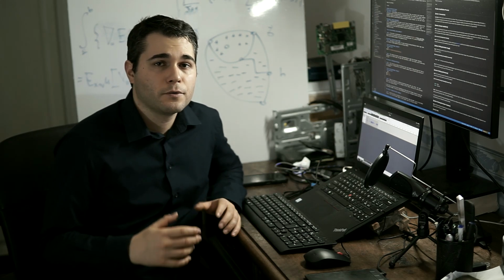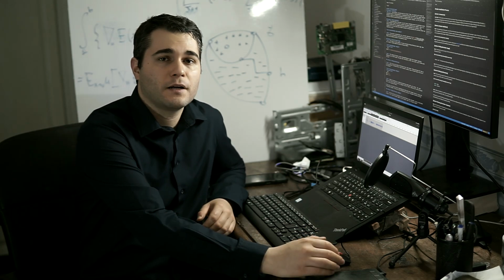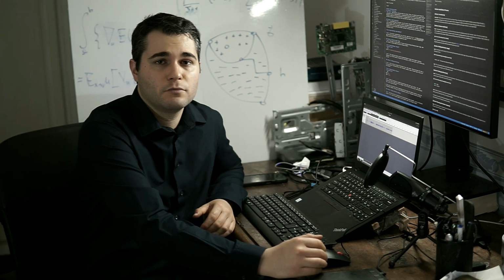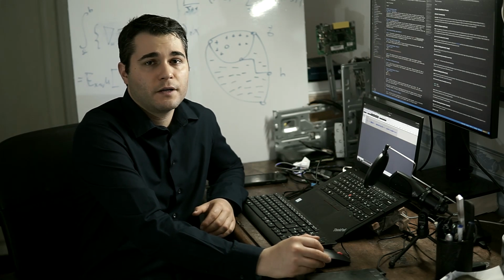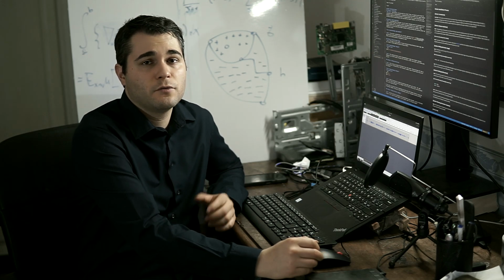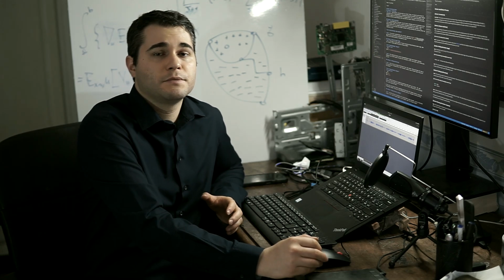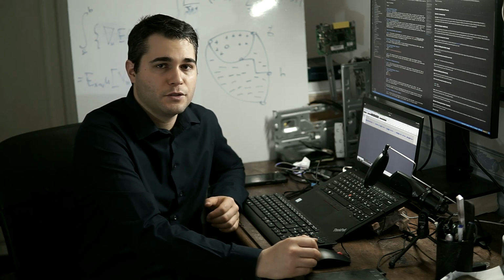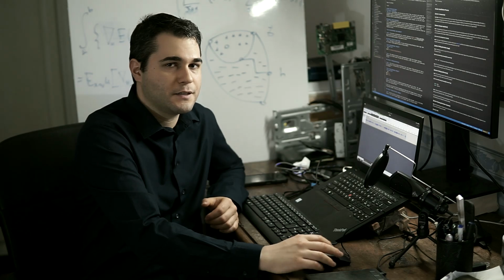Today we are going to walk through the installation process for BioSwiftAnalytics, a comprehensive package that includes several Jupyter notebooks designed to simplify and streamline the analysis process of biological data, and so a useful bioinformatics tool that helps researchers analyze biological data using Python and Jupyter notebooks. So let's get started.